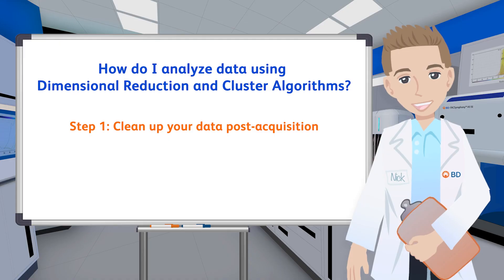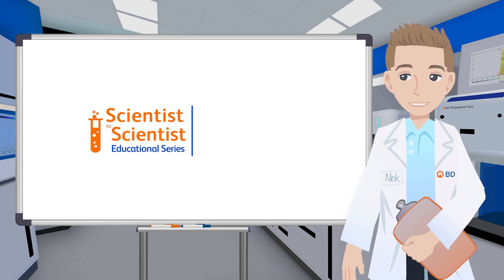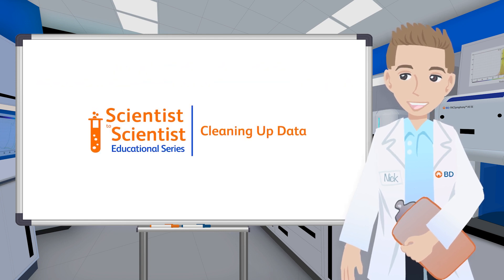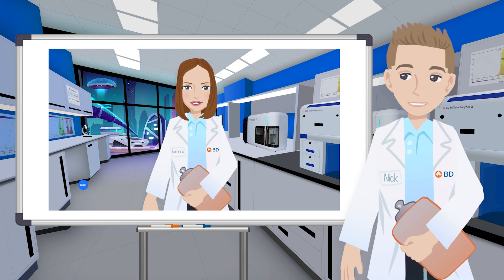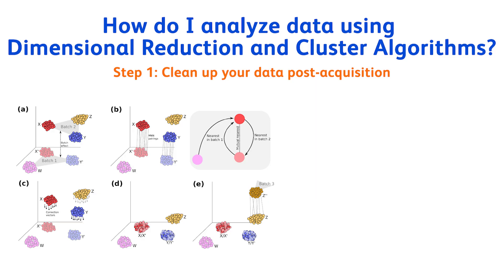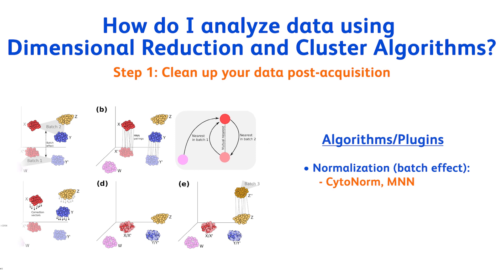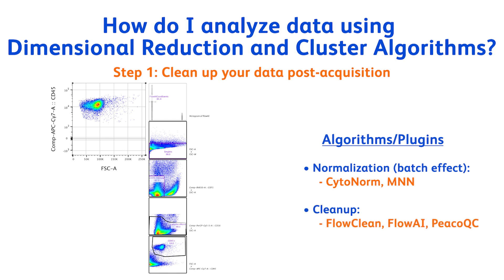The first step is to clean up your data post-acquisition. For more information on this crucial step, please refer to the 'Cleaning Up Your Data' video in this series. This step will remove batch effects and all unwanted events from your sample — clogs, debris, dead cells. You could even select a specific cell type, for example CD45-positive cells, if your research is focusing on a local site.